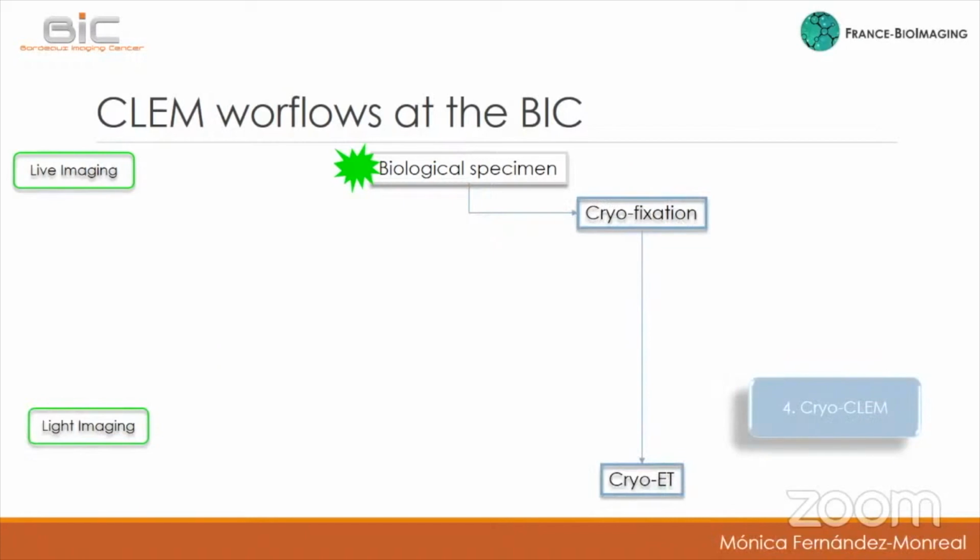And finally, I'll be talking about the Cryo-CLEM protocols, which is the more direct workflow from fluorescent specimen. You cryofixate the specimen. You can observe it directly by light microscopy and electron microscopy in cryogenic conditions.